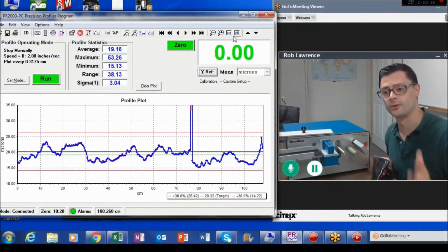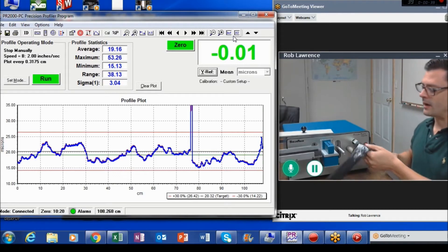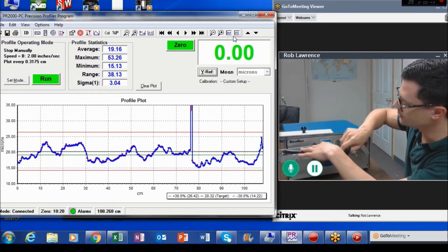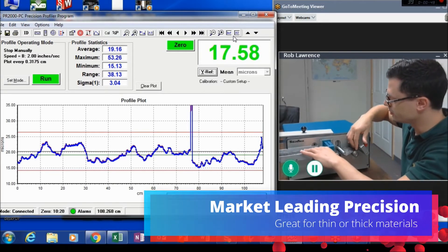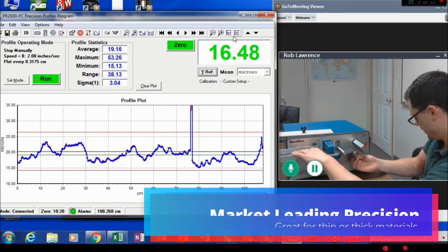This can be used by material producers, converters, and buyers of film for incoming product inspection. So I go ahead and load the device, and I'm going to take a reading every eighth of an inch. As you can see, I'm reading down to 0.025 micron precision, or about a millionth of an inch.